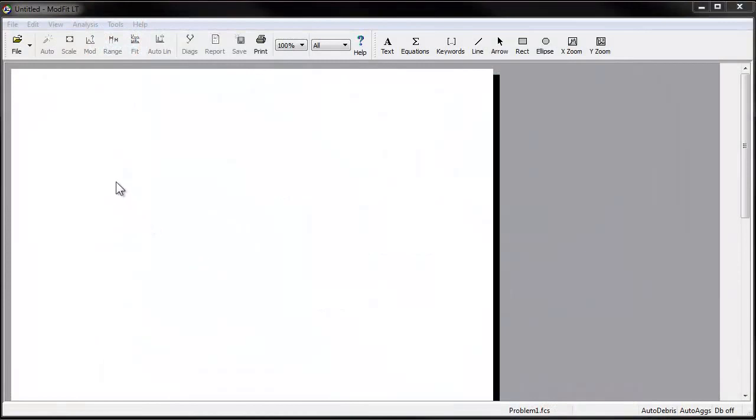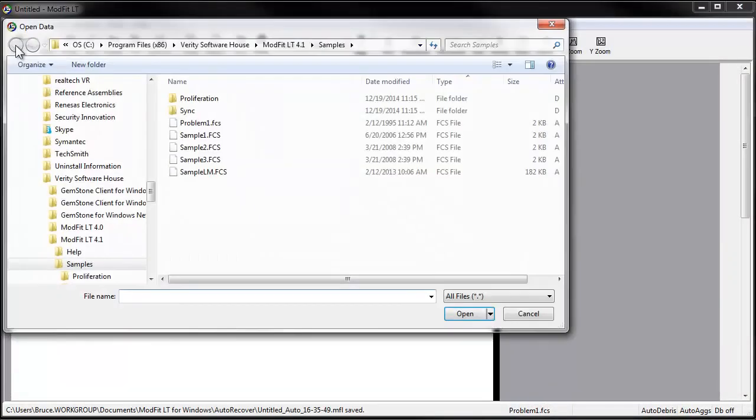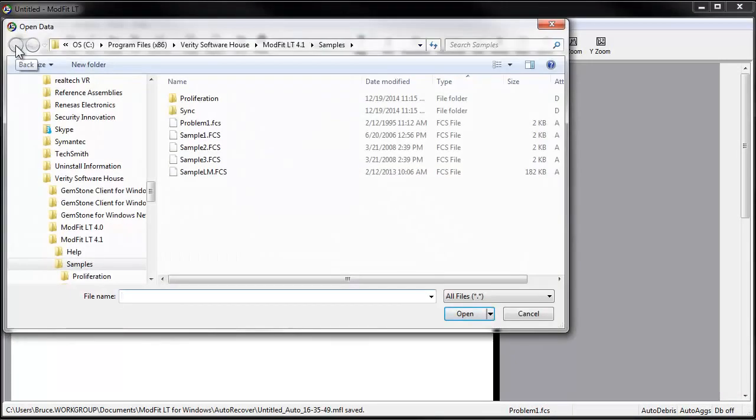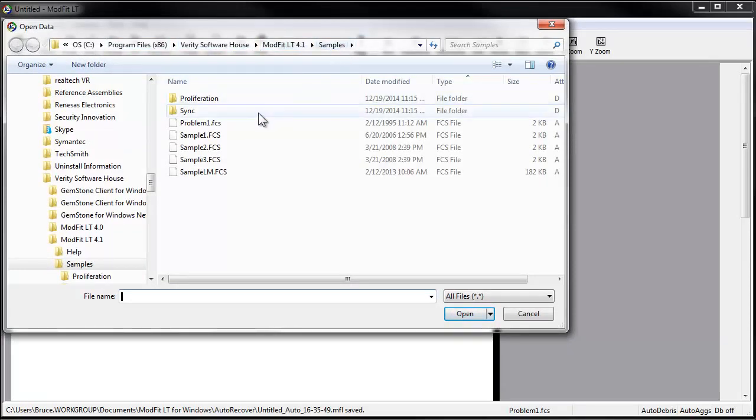With ModFit LT open, click the File button on the toolbar. Open the file Problem1FCS from the Samples folder where ModFit LT was installed.